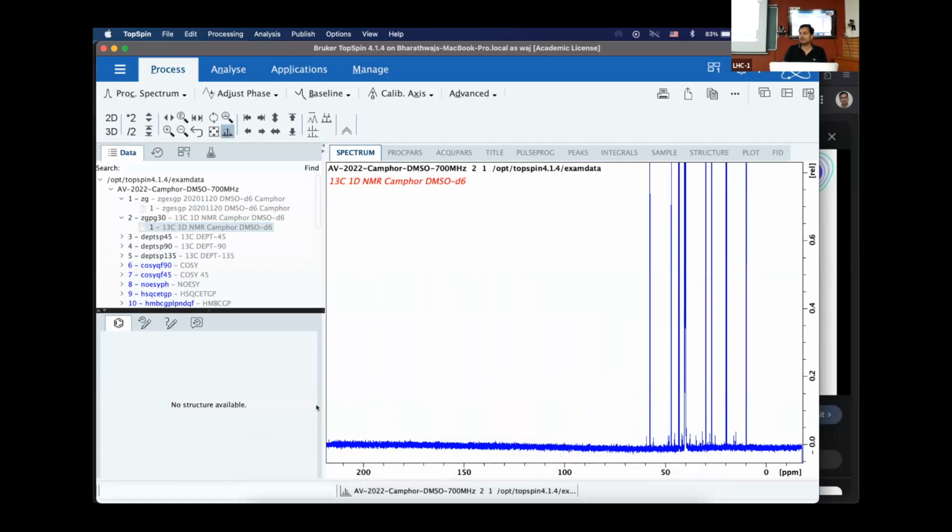It has characteristics that are not easy to allow it for detection, meaning that it has a very long T1, it has a very short T2. The carbonyl carbon, the oxygen ends up taking the electron more towards itself. So the chemical shift anisotropy of the carbonyl carbon is high in general, due to which relaxation happens faster. Therefore, its T2s are shorter and its T1s are longer. Therefore, getting them in a 1D carbon NMR spectrum is not very easy. Okay, so unfortunately, you have to believe me when I say it would exist somewhere here. But otherwise, you're able to pick up every carbon.